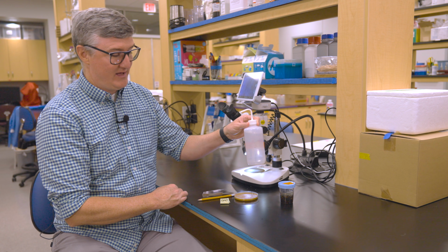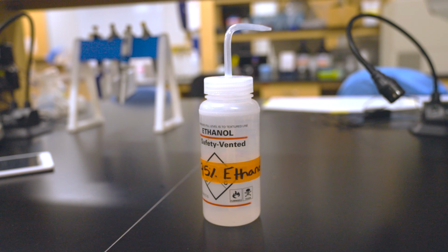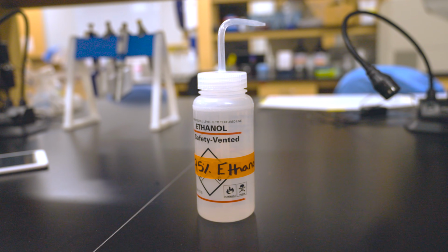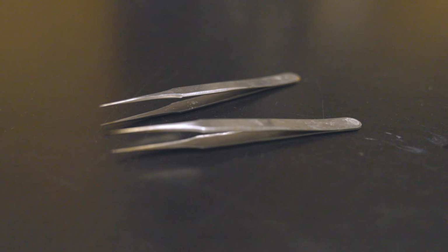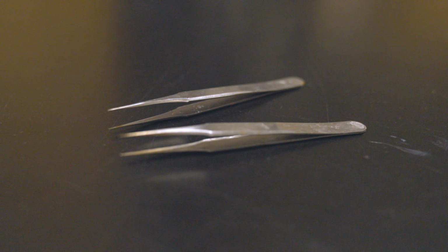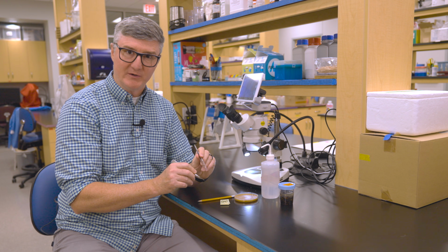I like to have an extra container of alcohol here. This happens to be ethanol, but again, you can use isopropyl or rubbing alcohol. You need 2 sets of forceps. These are needle nose or fine tipped forceps that you're really going to need for handling that bee while you're dissecting it.